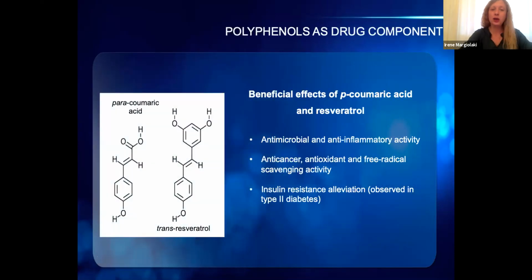And this is just one example of our work, very recent. We used polyphenols as ligands of insulin. There is a constant search for new therapeutics against diabetes. Diabetes became an epidemic, basically. So there is a constant search for new drugs having better absorption, distribution, metabolism, excretion, and toxicity. And in this game, we try to co-crystallize insulin with ligands which have a therapeutic effect, like polyphenols.